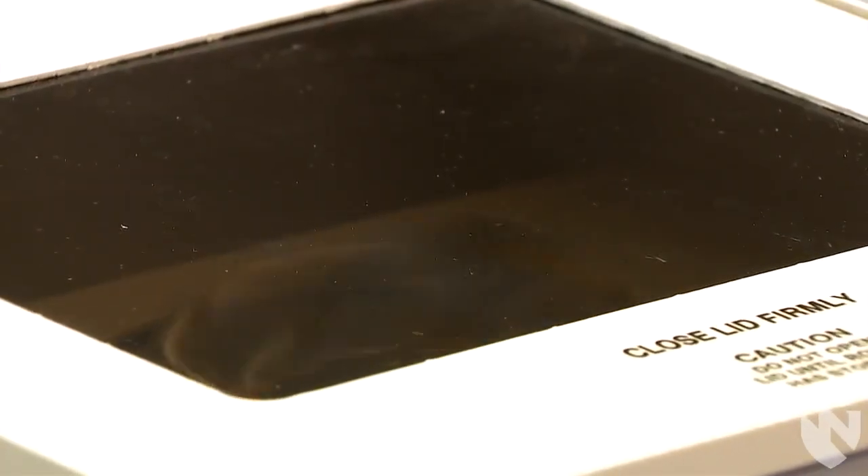Once you have confirmed the centrifuge is set for the correct time and speed, press the start button on the centrifuge.